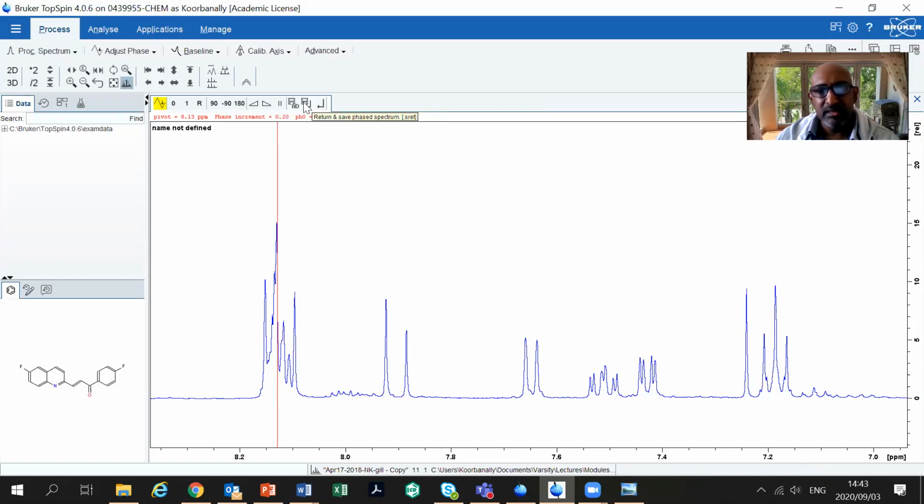All right, so I can either save and return, or I can just return. I'm not going to save and return because the phasing was right when we started off with. I just messed it up to show you how to correct it.